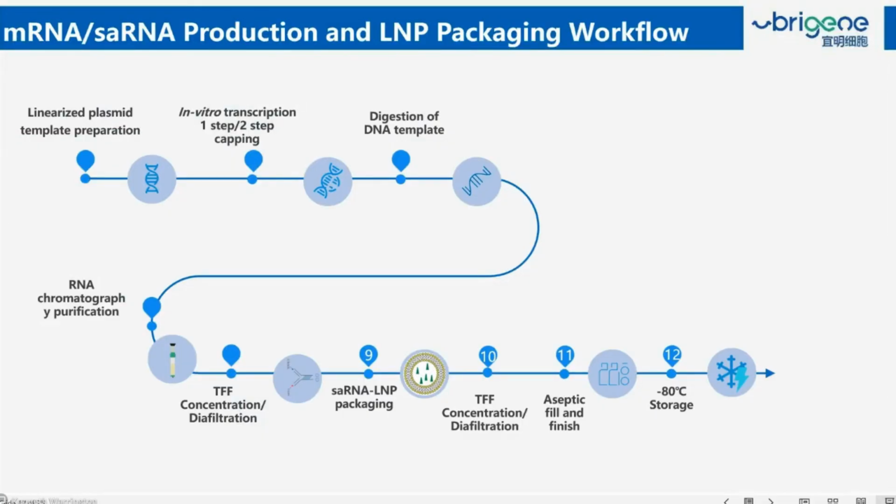Jumping forward into our workflow for mRNA, it's essentially the same as for self-amplifying RNA. In this case, we can also add to the workflow the packaging of these RNAs into LNPs.